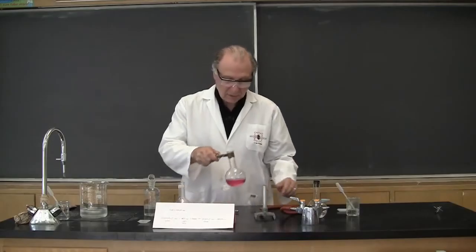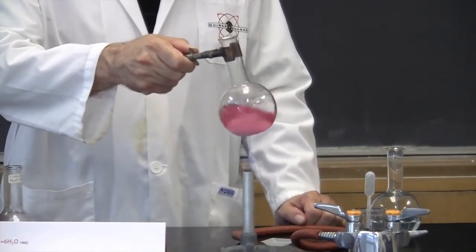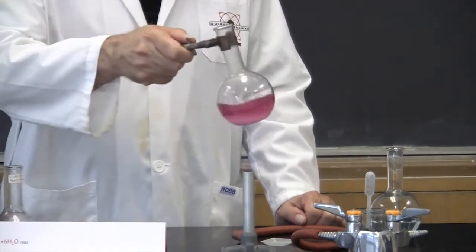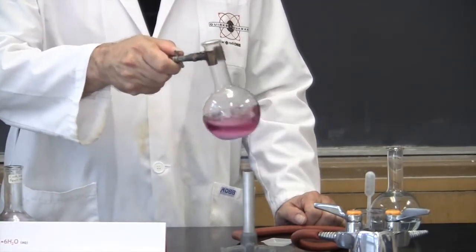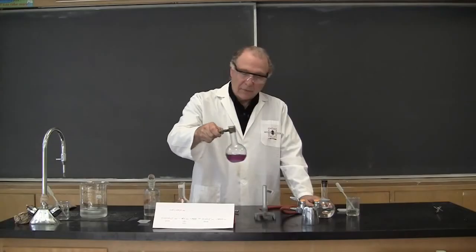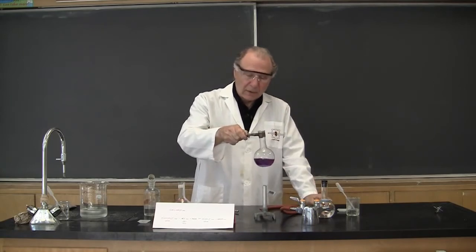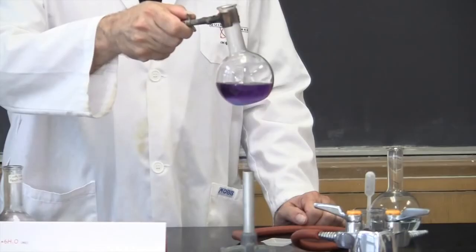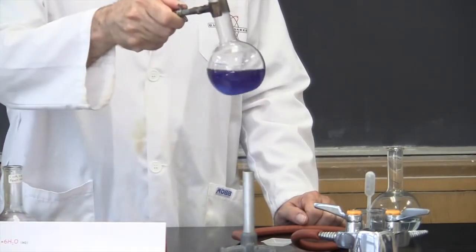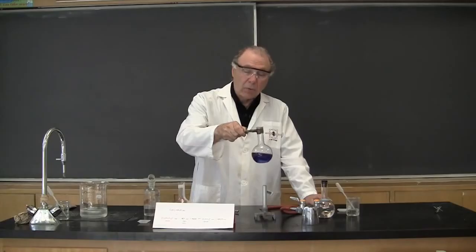Let's try it. This one has the potassium chloride in it saturated. There's the beginnings of a shift. If you hear the bumping due to the boiling, just take it out of the flame momentarily so it cools down. Now we've got the purple and here we're coming to that nice blue color that's typical of the tetrachlorocobalt complex.